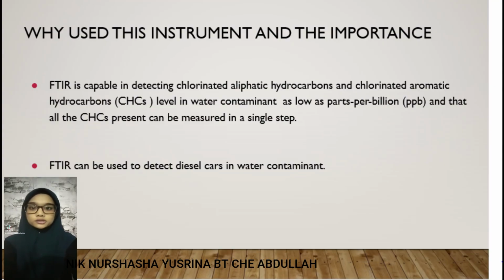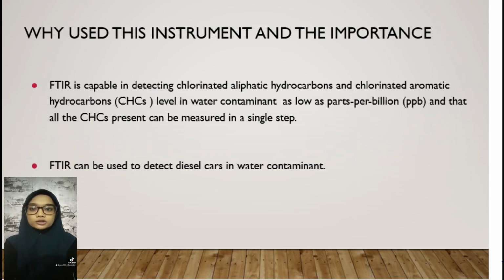Why use this instrument and why is it important? FTIR is capable of detecting chlorinated aliphatic hydrocarbon and chlorinated aromatic hydrocarbon levels in water contaminants as low as parts per billion. FTIR also can be used to detect diesel in water pollution.